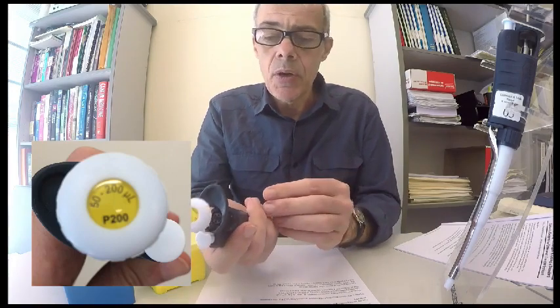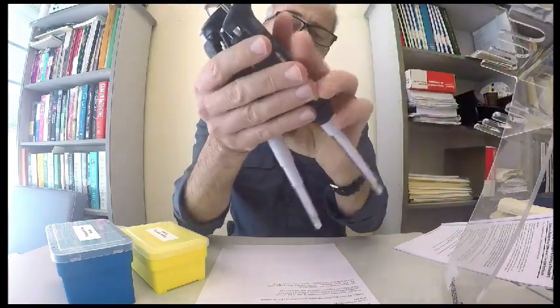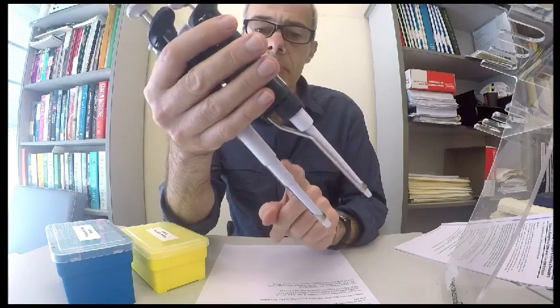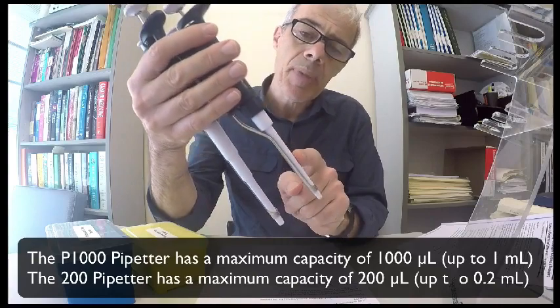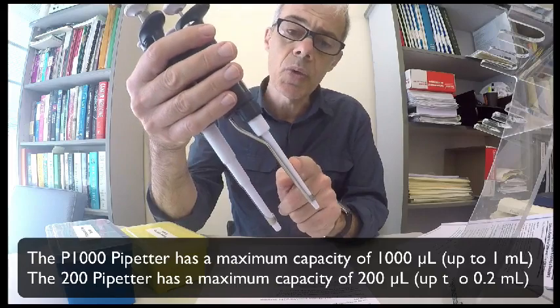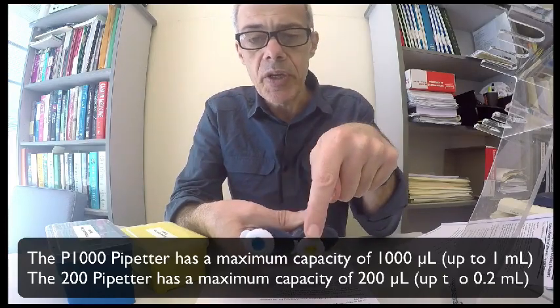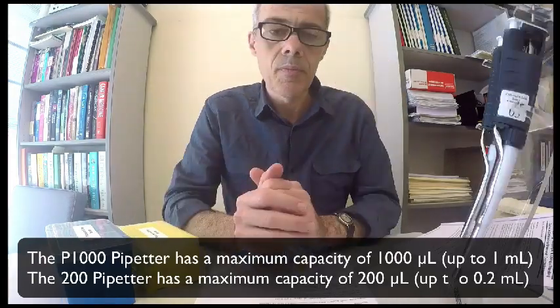If you look at these in comparison, you can see straight away the difference. This pipette here has a much wider barrel and can dispense a much larger volume, up to a milliliter or 1,000 microliters. This one has a much narrower barrel and can dispense a smaller volume, up to 0.2 of a mil or 200 microliters. So this is the P1000 and this is the P200, named according to the maximum volume they can dispense expressed in microliters.